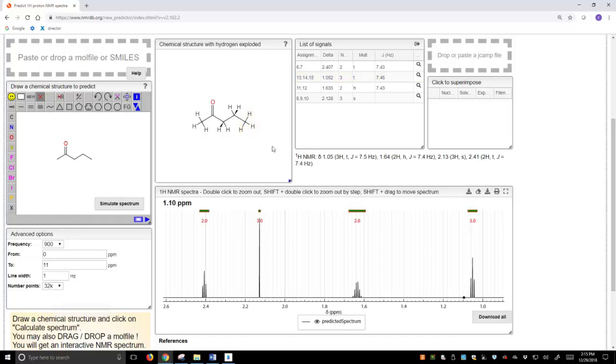Great. Okay, now let's look at these 2 hydrogens. Now, what is the multiplicity of that signal? It's a little bit messier. There are 6 lines, so it's a sextet. I think in this particular website it refers to it as a hextet, but I think properly it's called a sextet. So it's 6 signals, it's a sextet, and if it's 6 signals, that must be from 5 neighbors. Well, these 2 hydrogens indeed have 5 neighbors.